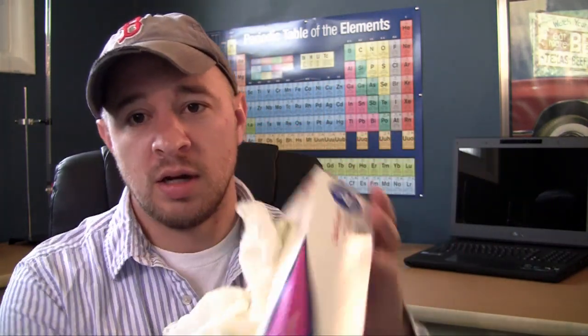Another thing that I always wear is gloves. I use rubber latex gloves because they fit tight to your hands and they allow me to handle everything nice and easily. So make sure you get a tight fitting glove that's also chemical proof. I recommend rubber latex gloves, but a lot of people are allergic to latex, so you might have to get something else.